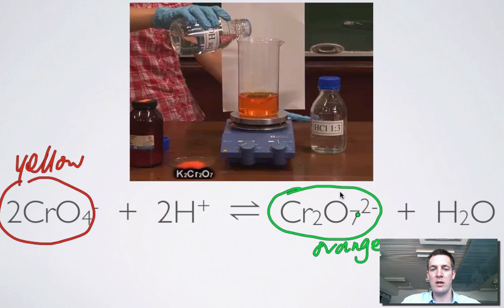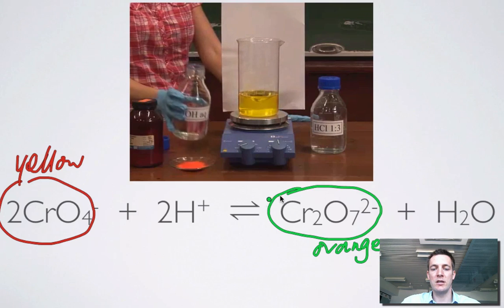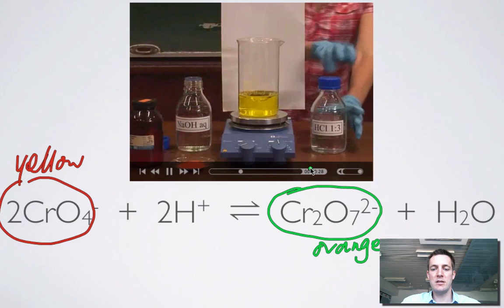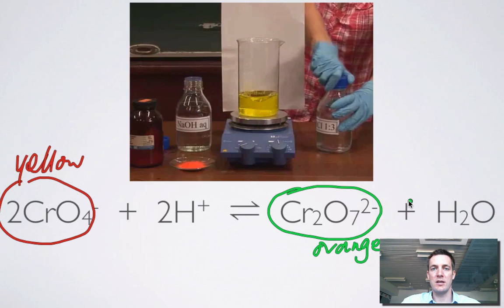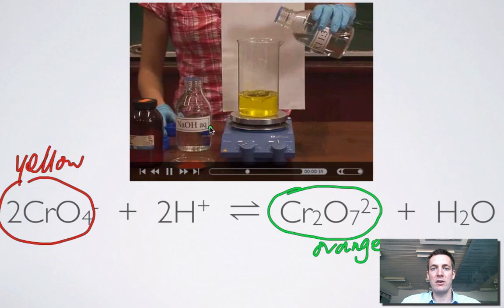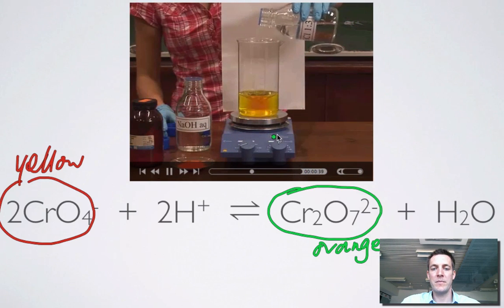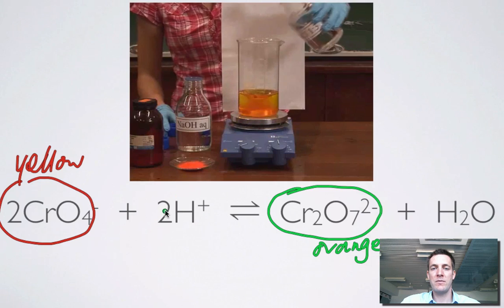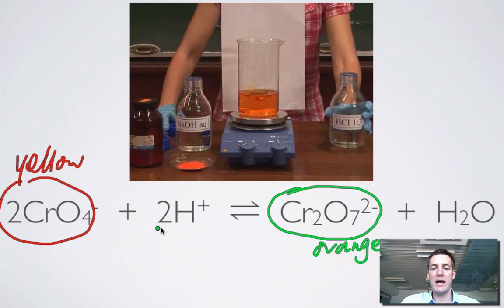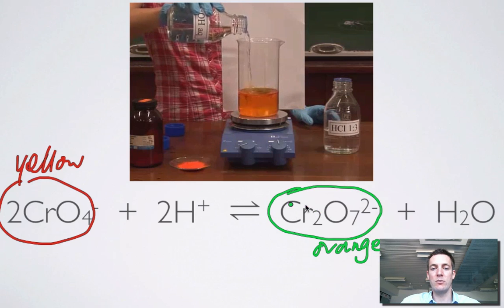And as we're adding sodium hydroxide to this system, the orange color will gradually turn yellow. Now, it doesn't seem to be any hydroxide ions here. But you might be able to think about what's going to happen if you do add hydroxide ions. Here we're adding some H plus ions. Adding H plus. So from what we've seen already, if we add a reactant, we should expect it to go to the product side. And it did. It went orange.